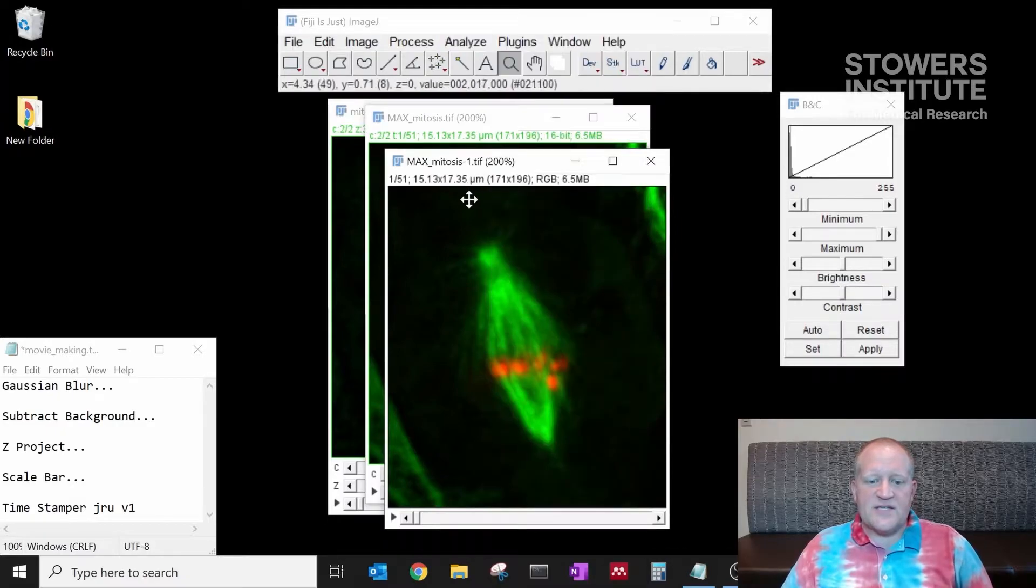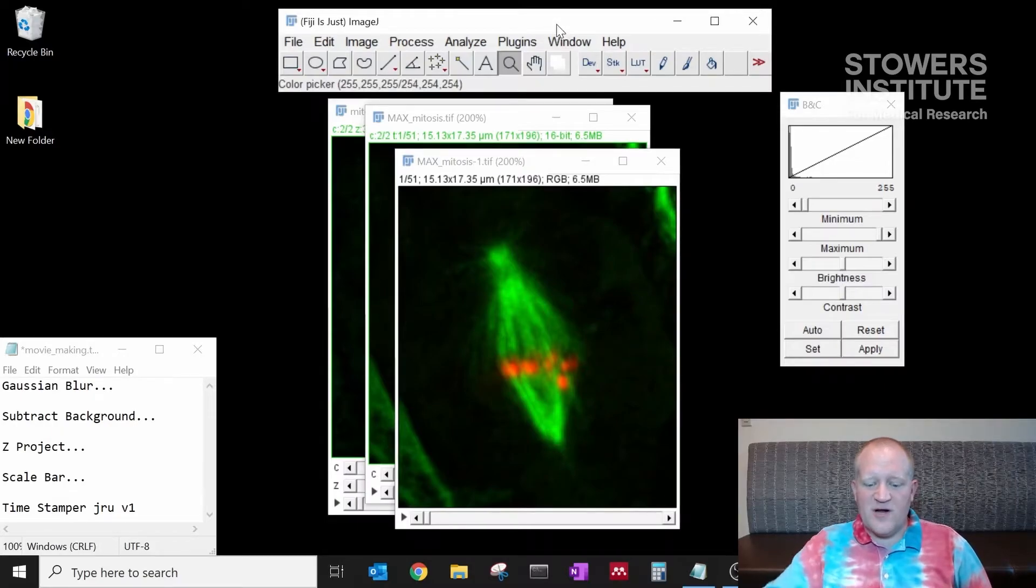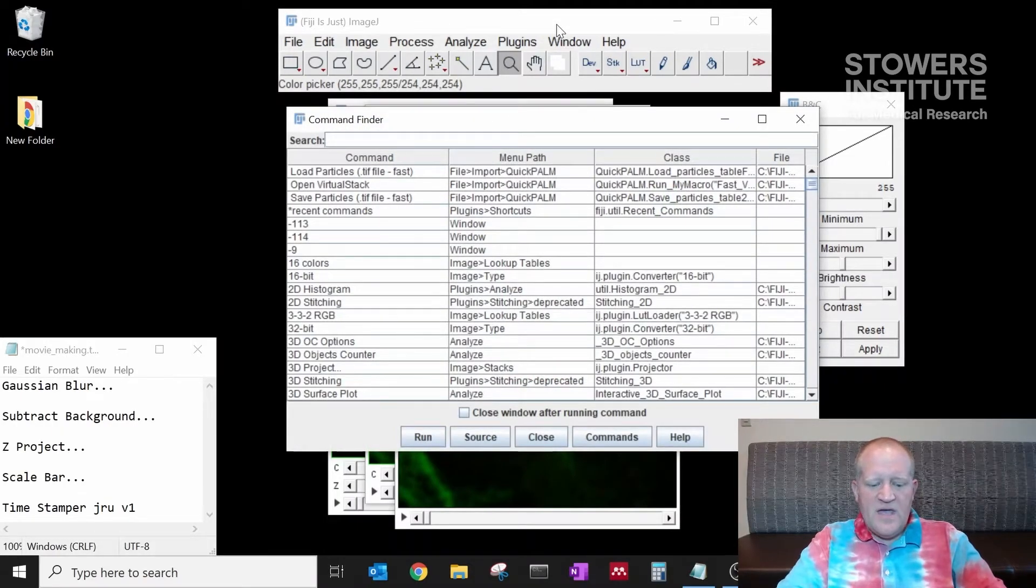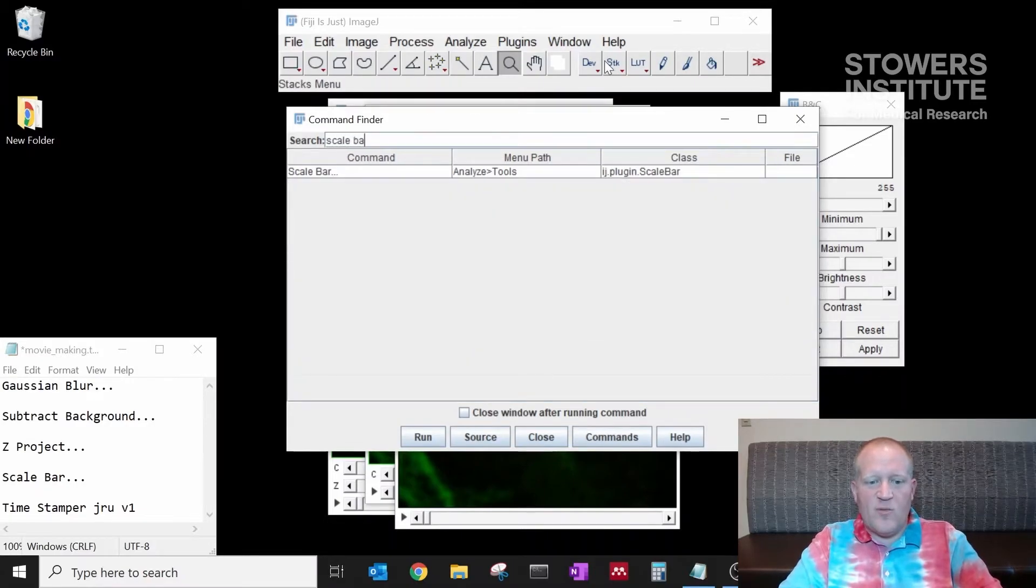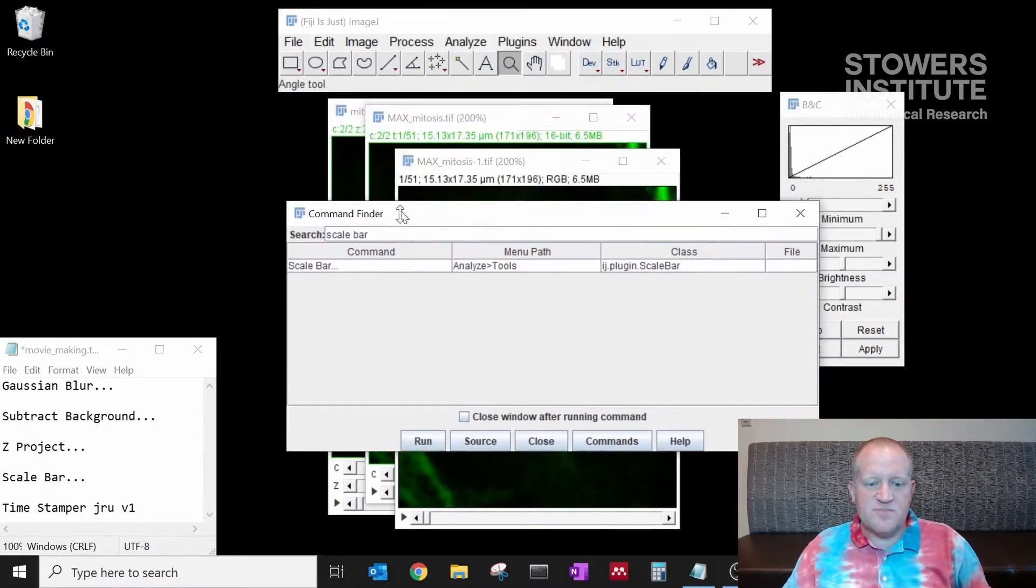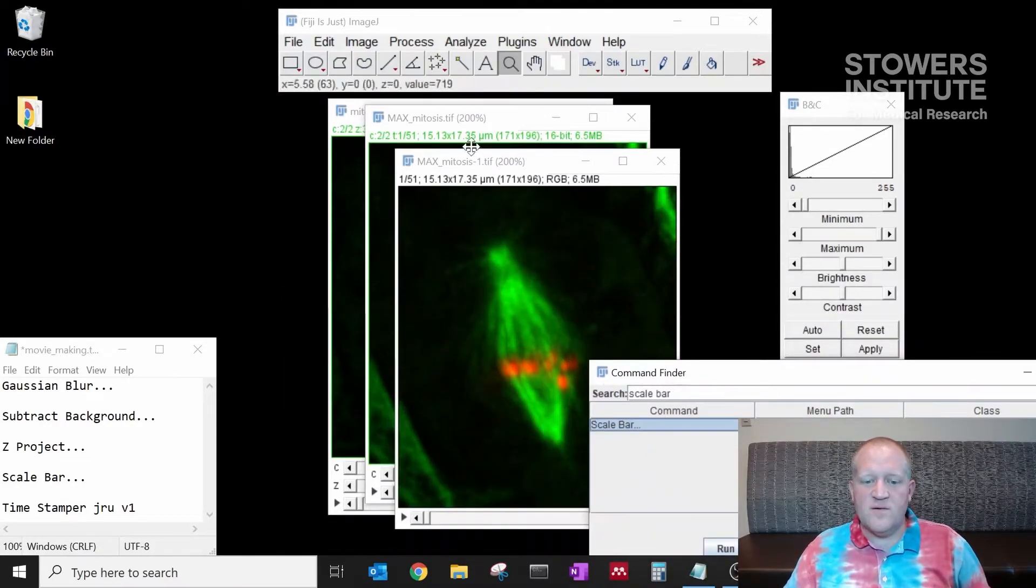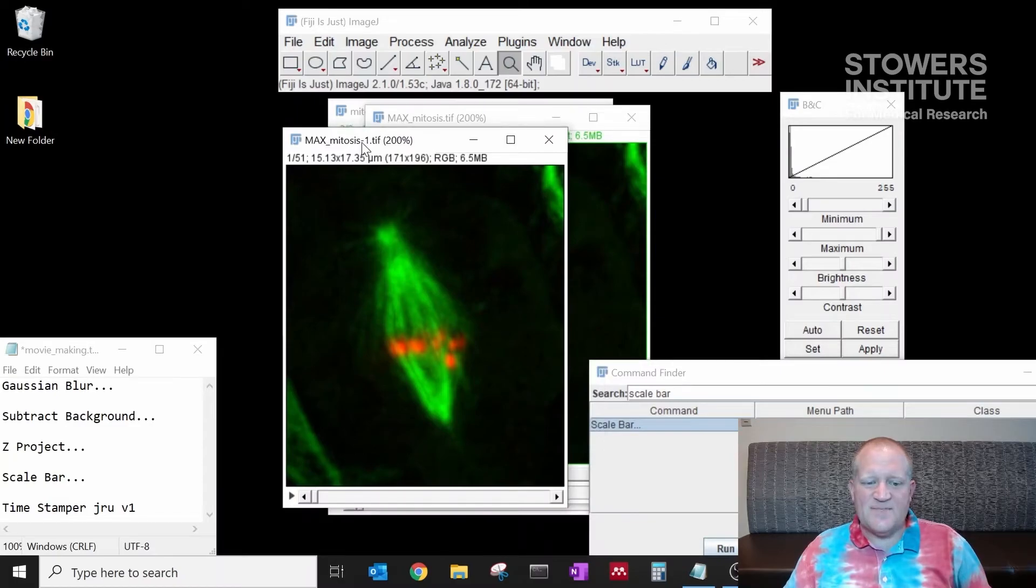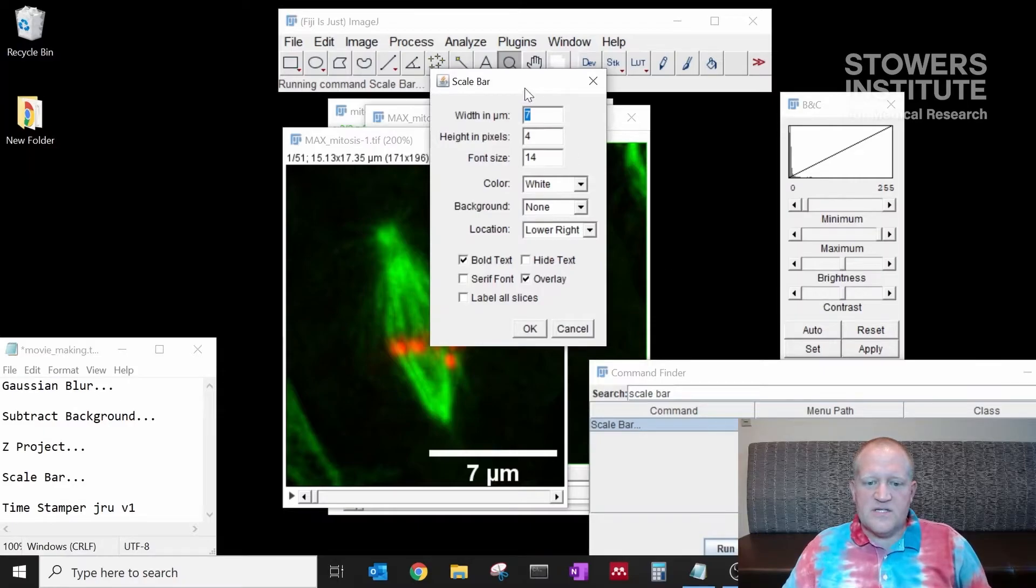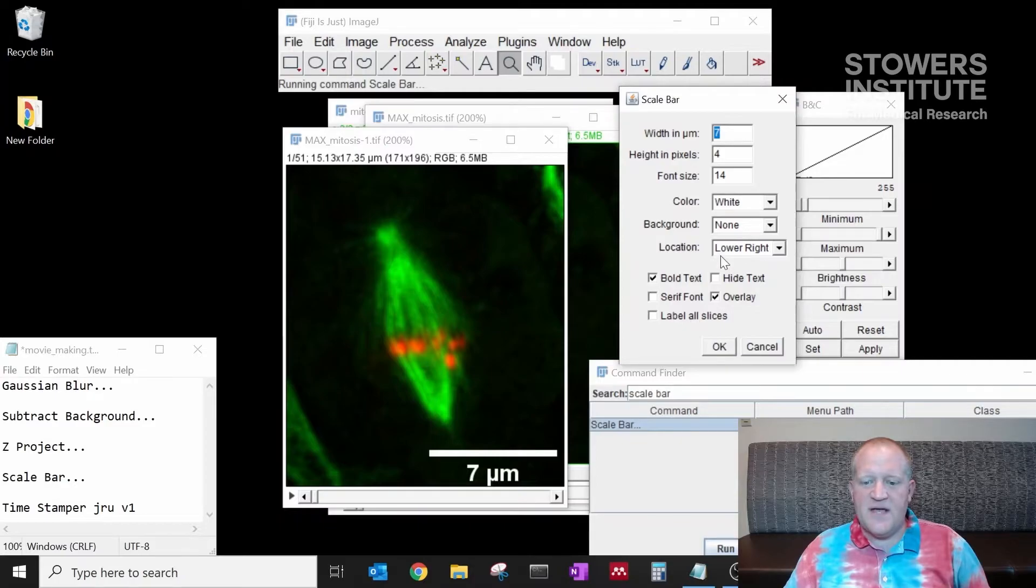Now that we have the scale attached to our data I'm going to click on the Fiji bar and type L and I'm going to look for the scale bar plugin. I'm going to go ahead and just move this out of the way. I'm going to select the scale bar plugin, select my data set and click Run. This gives me a lot of options. It gives me the width that I want to display and some characteristics about the bar itself.